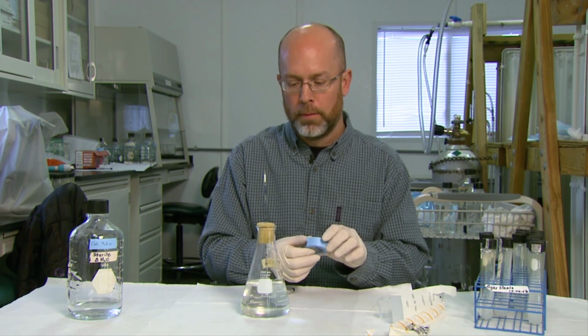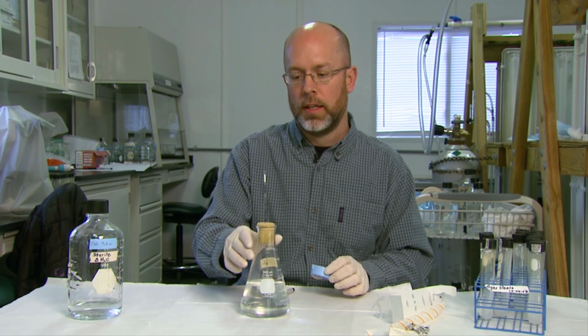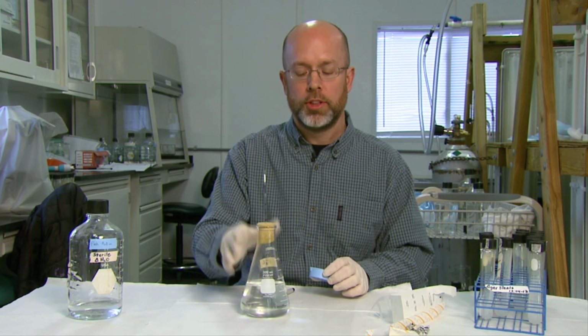So it's really important before you put the inoculum in to put a label on this that tells you the species that's growing in there and also the date at which you place the inoculum in the flask. Not only does that identify what species you have, but you also are going to be on a schedule where you're going to back these things up just like the slants every couple weeks or 3 weeks. So you need to know exactly what date this culture was started so you know when to back it up.